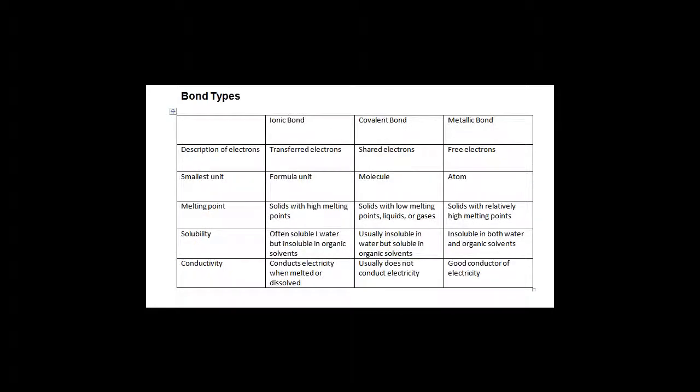We'll record the results for both the acetone and the water solutions made, and then we'll also attempt to record conductivity for solids. Make sure that you get a small piece of the substance, a single crystal, and make firm contact with the electrodes on either side of the crystal to see whether current is able to pass through the substance.